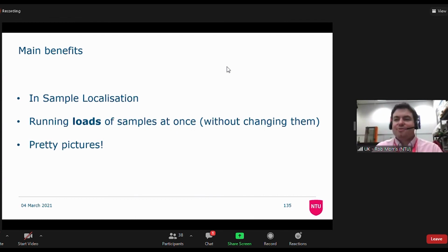The other thing that it's really good for is making a pretty picture, and it sounds very patronizing, but a lot of the time, if you have a pretty picture of something, people are much quicker to believe what you're saying and understand what you're saying than they are when you show them a relaxation graph, or this is T1 and T2. Sometimes having a nice picture of it really helps sell it, and MRI is fantastic at that.